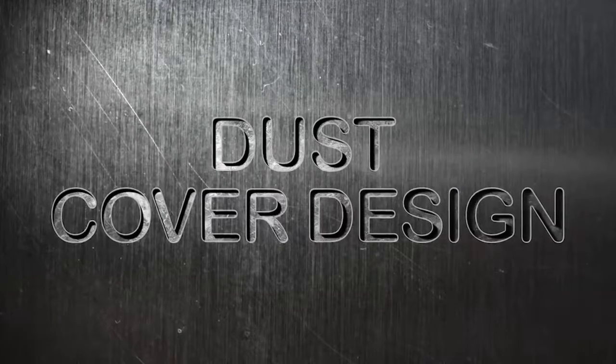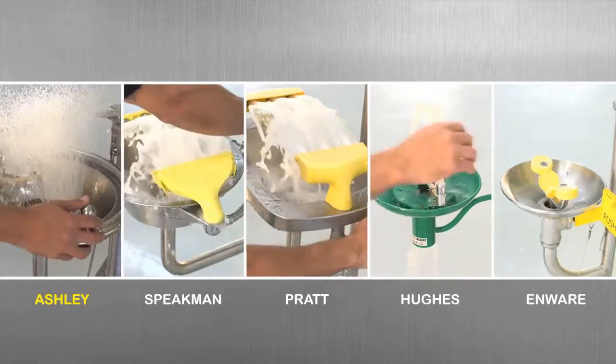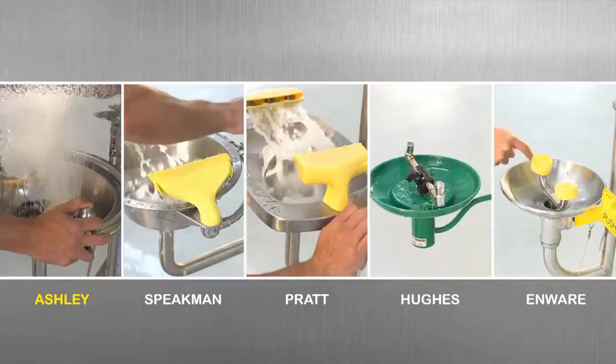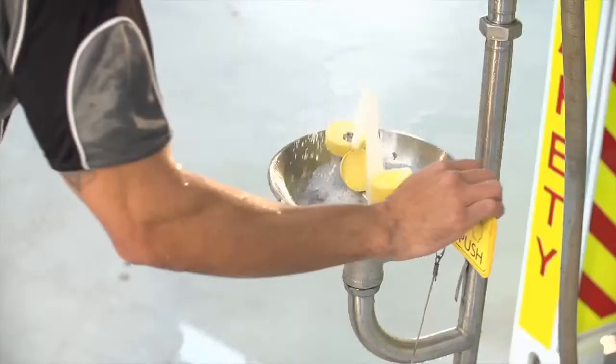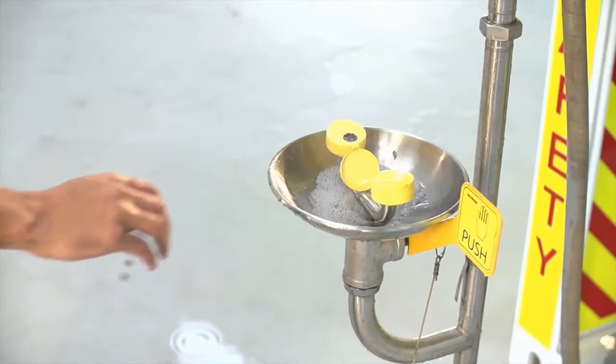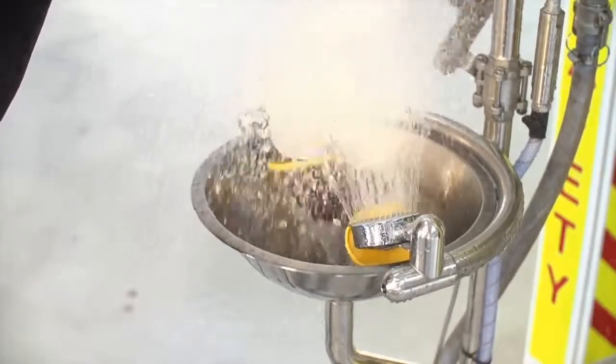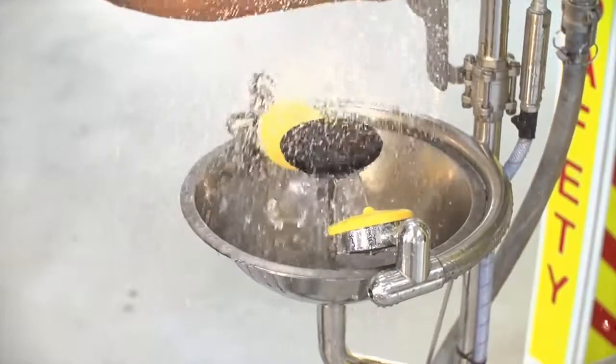Dust cover design. Dust clogging the shower jets can cause a shower not to function when it's needed most. Some designs have cheap plastic covers that repeatedly break off or fail to reset themselves after use. Ashley's have been well engineered to stand the test of time and automatically reset after each use.